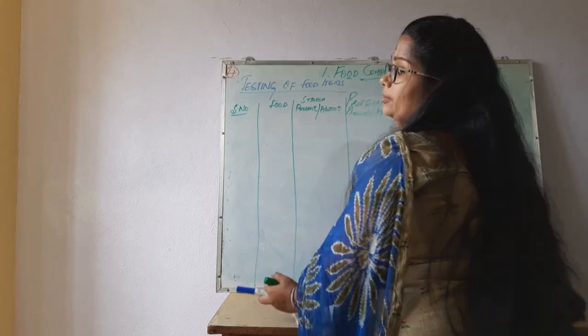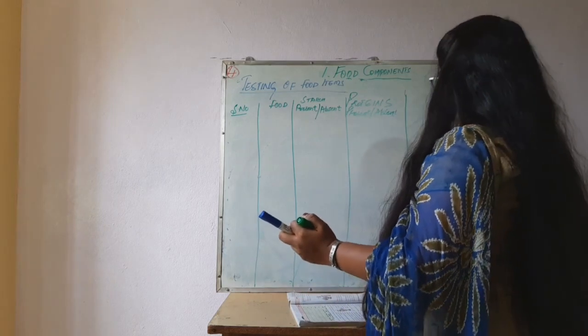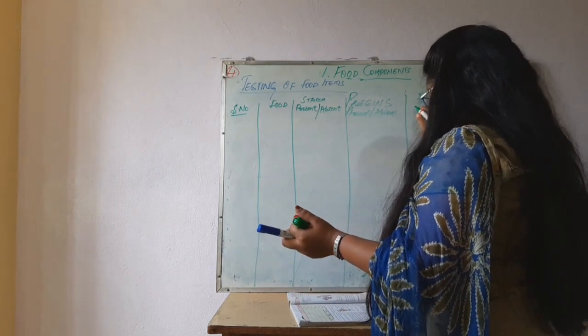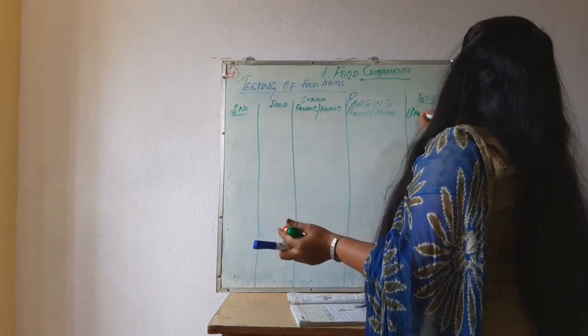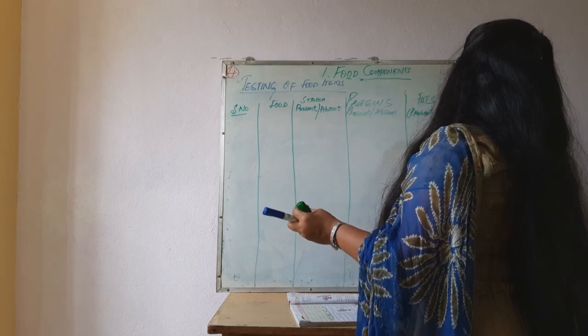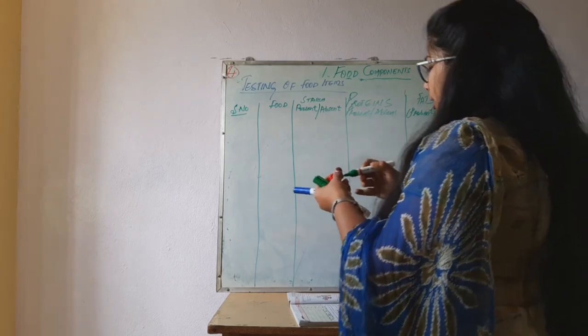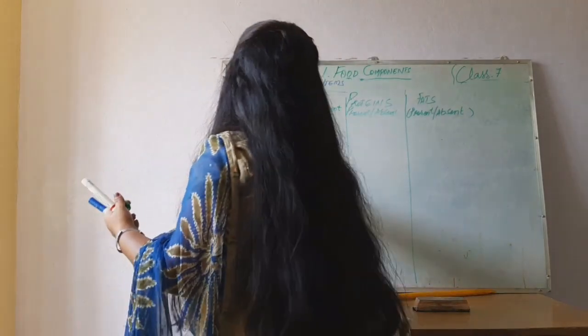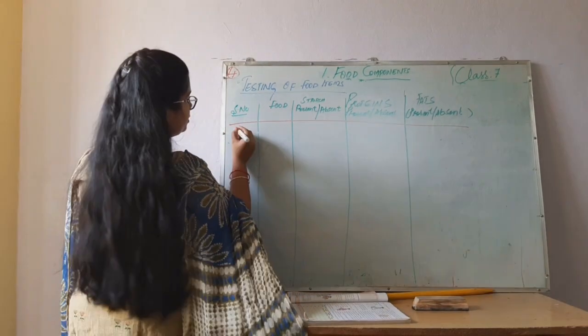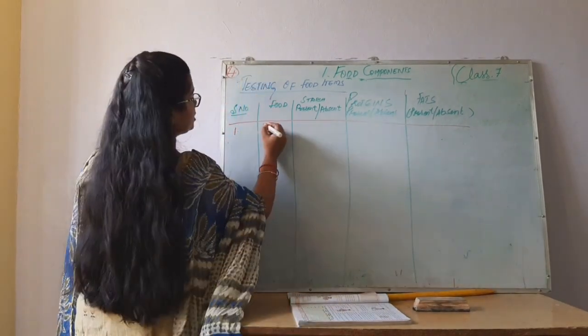Next is fats. Present or absent. The food items given to you, you have to test with the above experiments to see what components they contain, whether starch, proteins or fats. First one is rice.